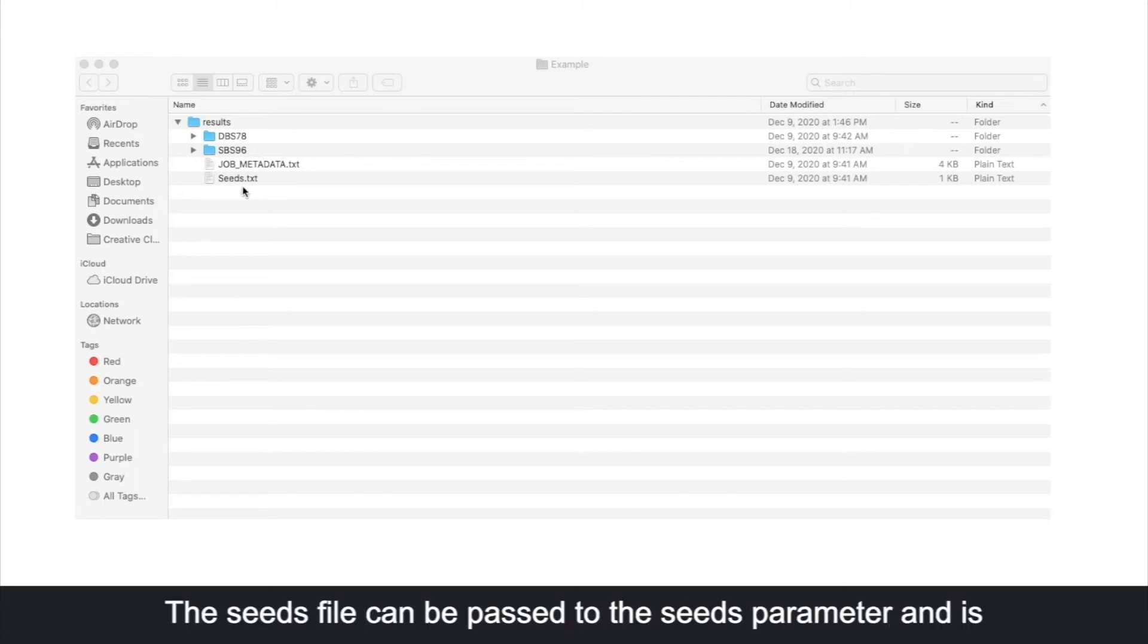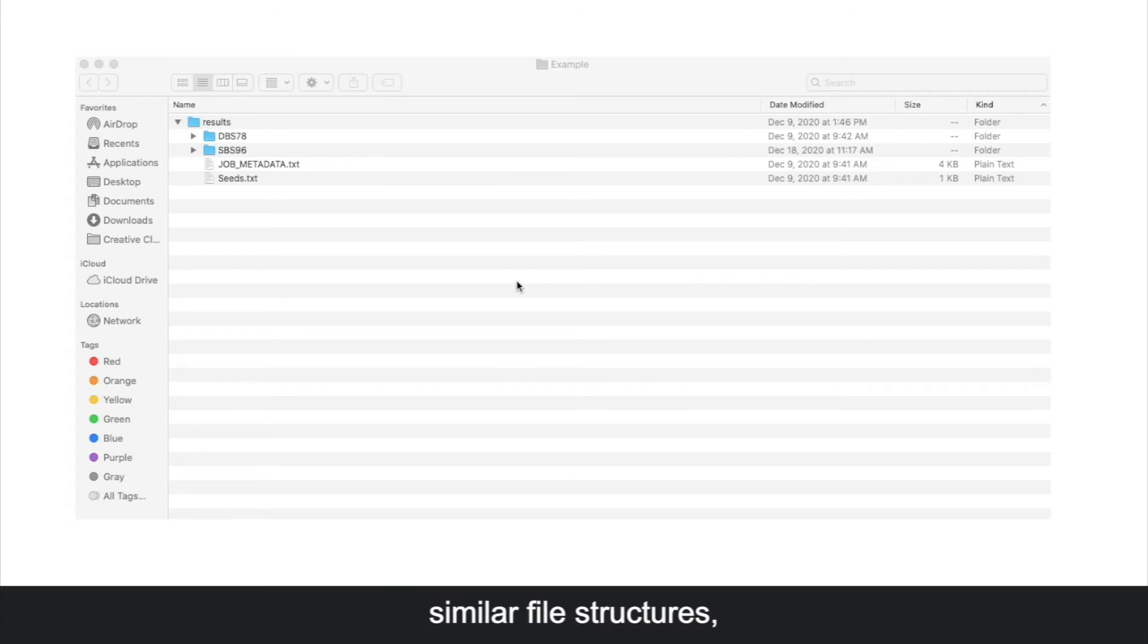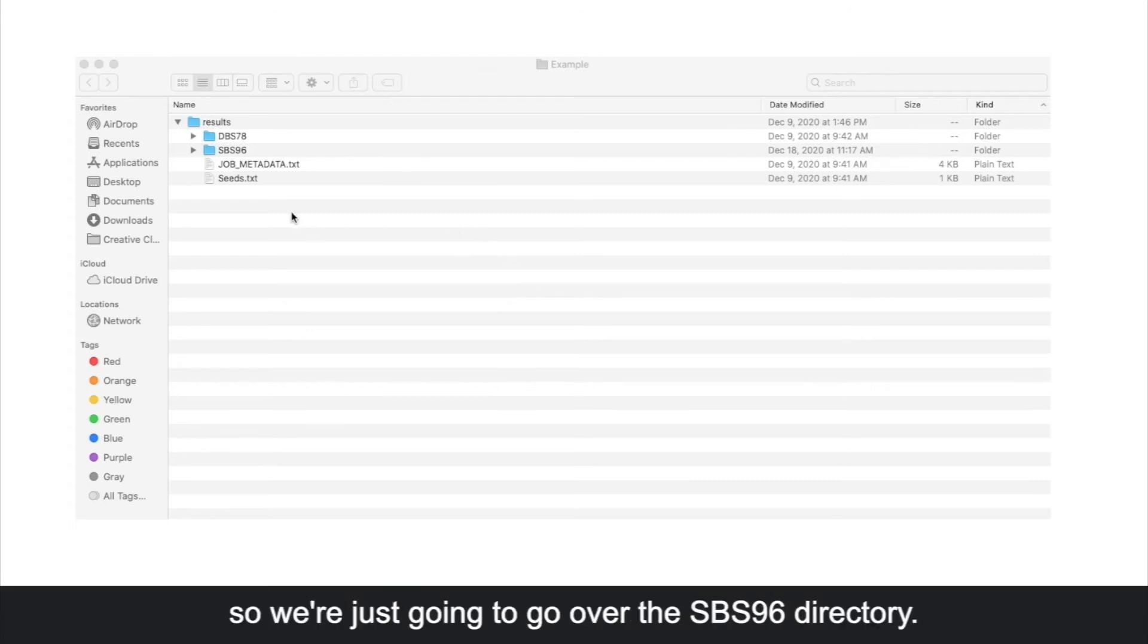The seeds file can be passed to the seeds parameter and is used for reproducing runs. The dbs78 and sbs96 directories have similar file structures, so we're just going to go over the sbs96 directory.